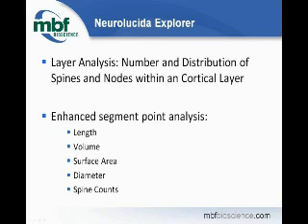Dr. Patel asks if it's possible to upgrade the software, or whether we will have to buy a new imaging system altogether. This is version 10, so upgrading your software to version 10 will give you these features. There are additional modules, such as the image montage module, image stack module, and virtual tissue module, that are add-ons to the base software. They add functionality that isn't necessary for all applications, so those would be additional modules. We'd be happy to talk to you about upgrading, certainly.